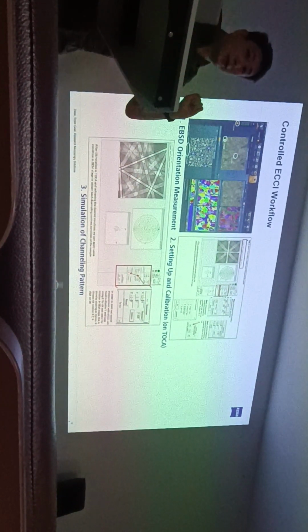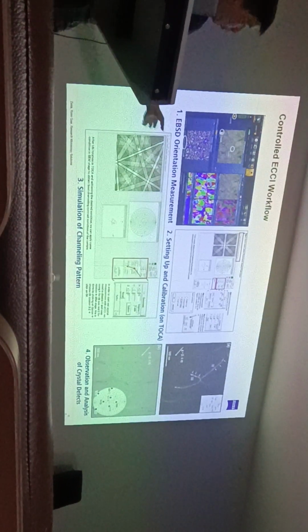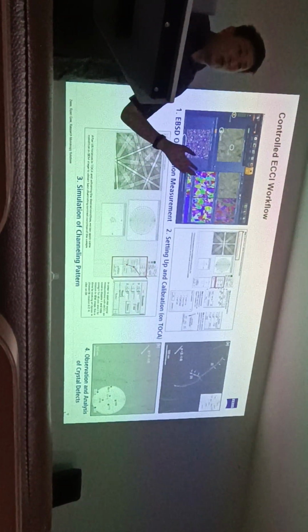So we know exactly this fault is against which kind of crystallographic orientation. Am I being clear here? So this is really a very great tool for you guys who work in metal or material science research. Then from there we can do the analysis and so on.